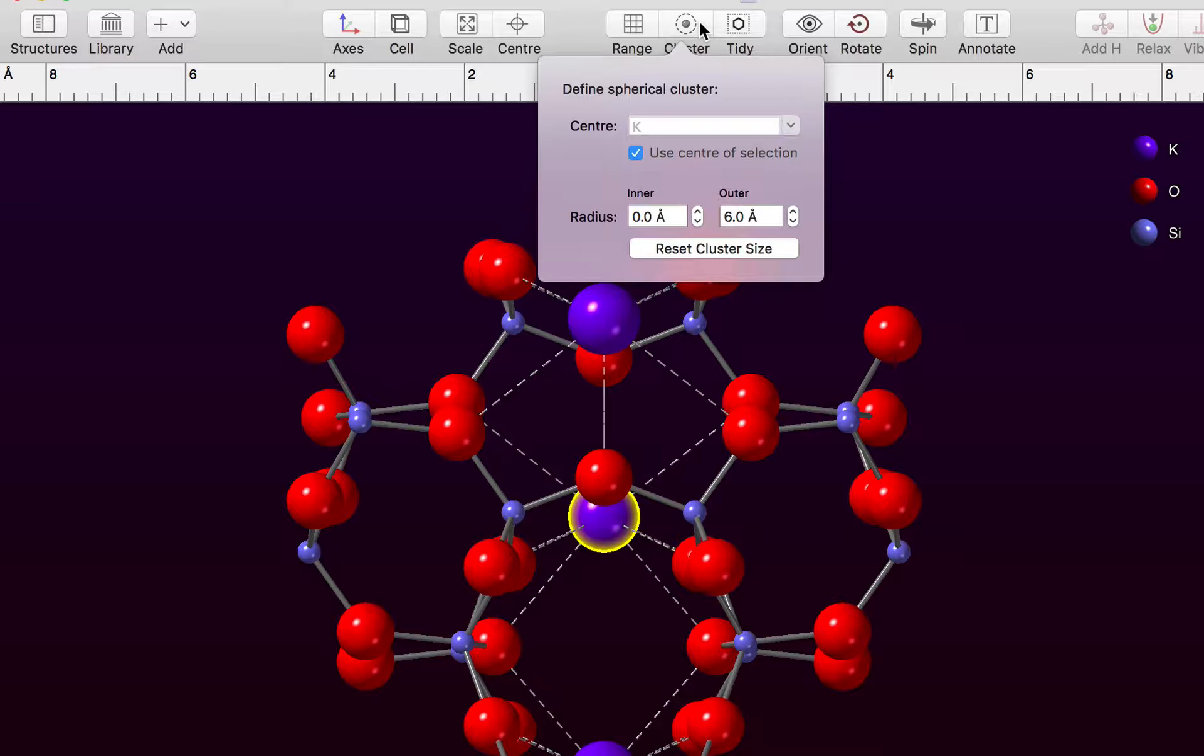We've selected the atom and CrystalMaker has detected the selected atom and enabled the use center of selection checkbox, then it's displaying a default cluster of six angstroms around that atom.